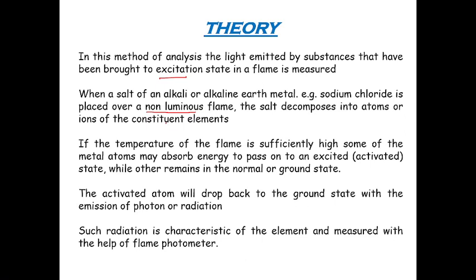So when a salt of alkali or alkaline earth metal, sodium chloride, is placed over a non-luminous flame, the salt decomposes into atoms or ions of the constituent elements. Now if the temperature of the flame is sufficiently high, some of the metal atoms may absorb energy to pass into an excited state, while the others will remain in the normal or ground state.